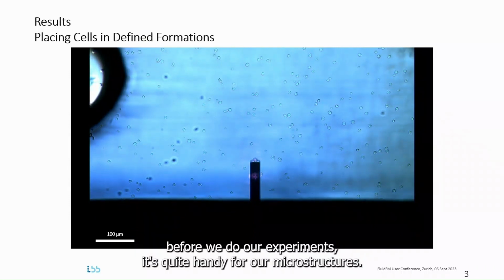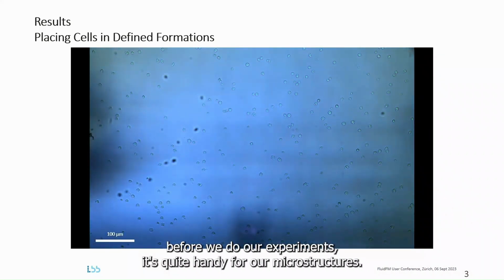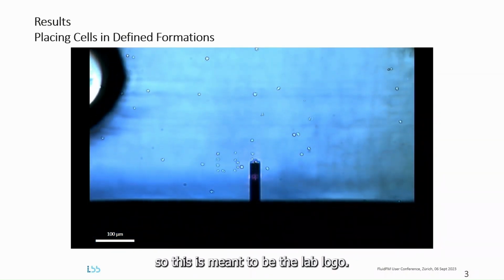Because the FluidFM OMNIUM allows us to pre-program the points for picking and placing before we do our experiments, it's quite handy for our microstructures. We can pre-program these into it, and we can also create nice little images with the cells. So this is meant to be the lab logo.